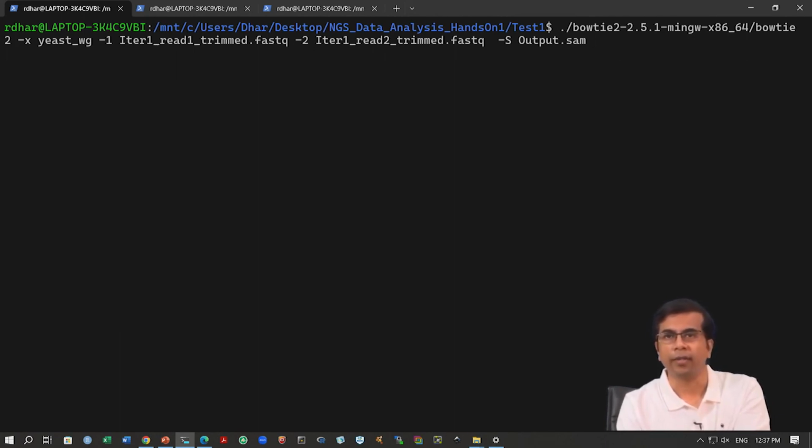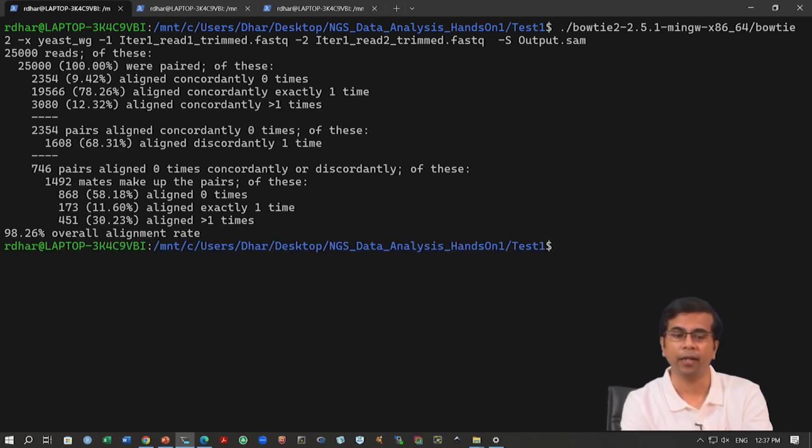Okay. So, it will take a few moments to generate, but it is actually very fast, as you will see. And we are dealing with very small data. We are only mapping 25,000 reads, 25,000 paired entries. So, we have 25,000 pairs and it is done. If you are dealing with big data sets, you will see it will take quite a bit of time and much longer than this, but it will still be in hours, not in days.